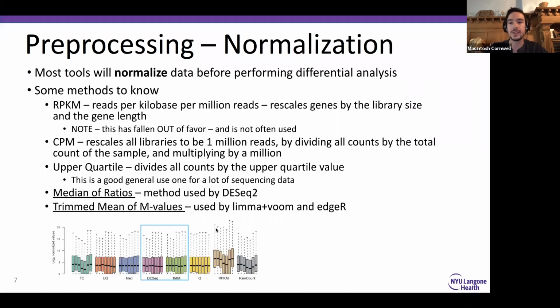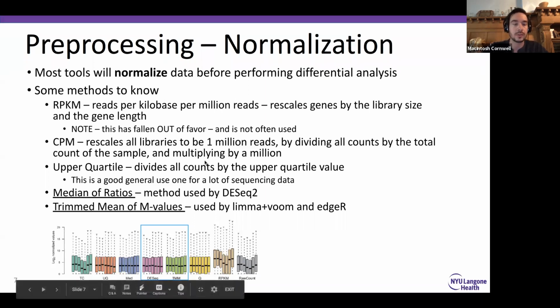The other pre-processing step is normalization. Igor touched on this previously, but I'm going to go over it again, but mostly in a broad strokes manner. I'm not going to get into any of the math of it because a lot of that is not actually necessarily pertinent. So a lot of these tools have normalization already built in, so this will not be a separate step you will do yourself, but it's still an important concept to understand.